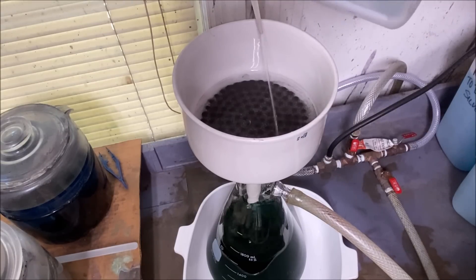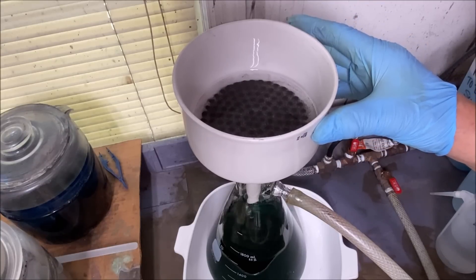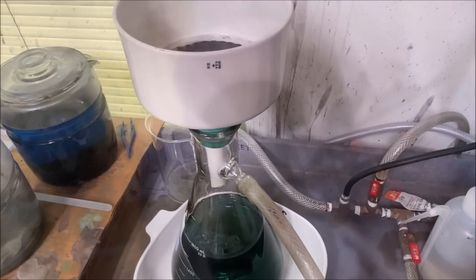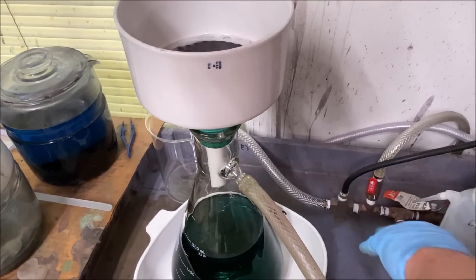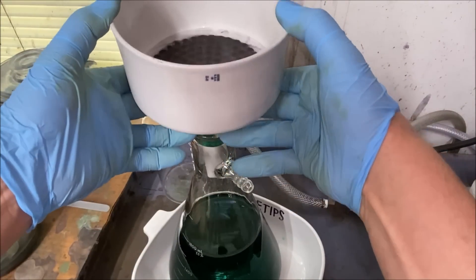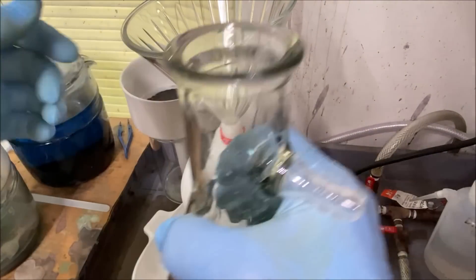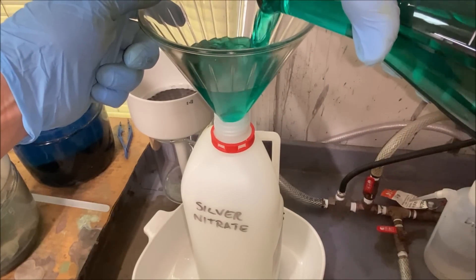You'll notice the paper filter has some black material in it, and this could be precious metals. So once we get all the silver rinsed off this filter, I'll save it and put it in my paper storage for later recovery. I've got all the silver nitrate pulled through that filter now. I shut off the vacuum, remove the funnel, and use an empty nitric acid bottle to store my silver nitrate solutions until I'm ready to cement them out on copper.